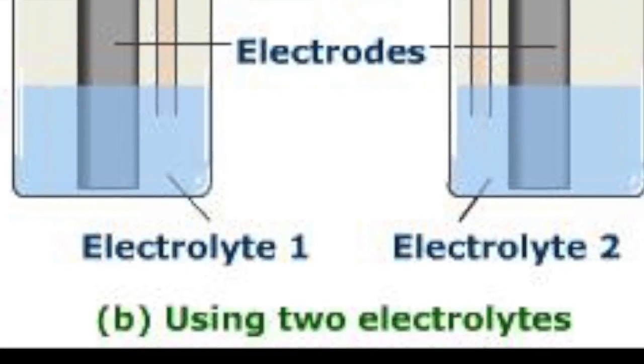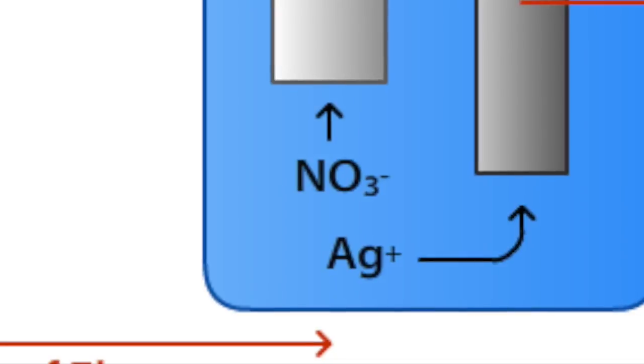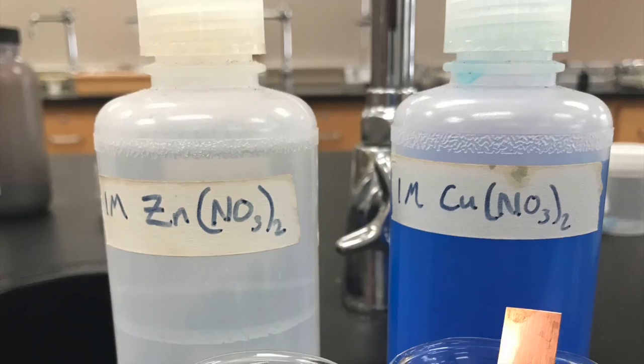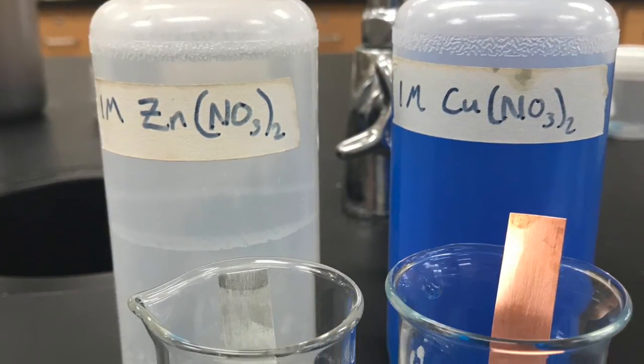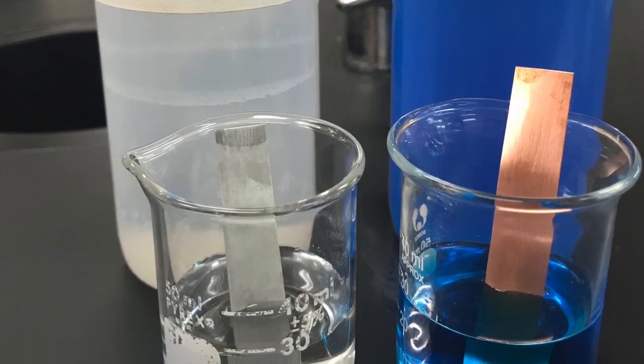With the solutions, electrodes are also needed to be reduced or oxidized. Select the corresponding metal to each solution and place it in the solution. For example, put the zinc metal in the zinc solution and the copper metal in the copper solution. They should be half submerged so the probes of the voltmeter can touch the electrodes, and not the solution.